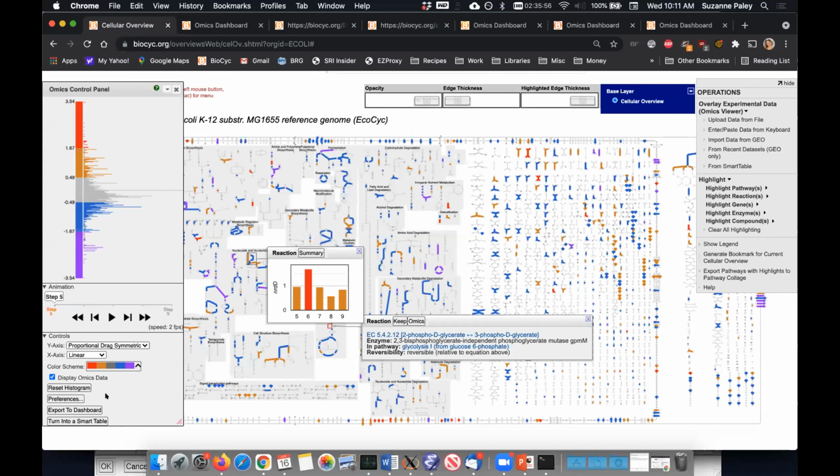But as you said, it's important that you map the values to the same numeric scale, because you want consistent color assignments. So you need to think about mapping the data in that way. You could also combine transcriptomics and metabolomics data in one file. But again, you need to worry about the color scale and consider mapping the data to a common value range.